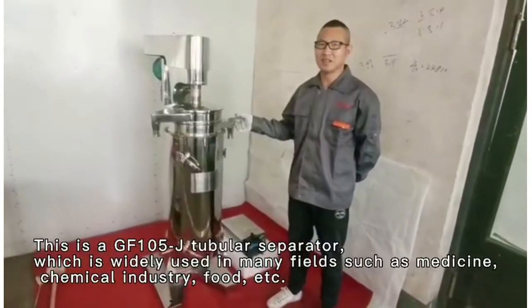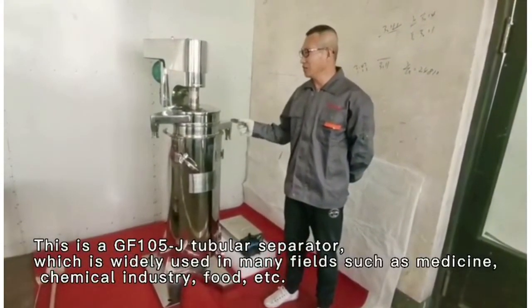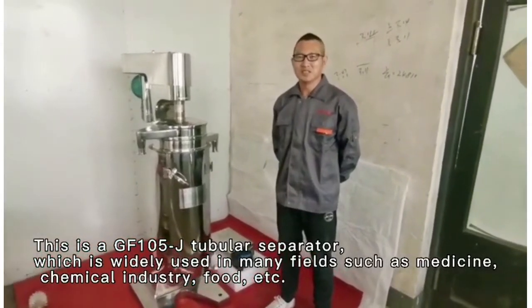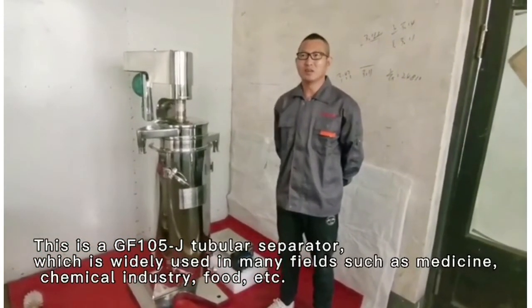This is a GF105-J tubular separator, which is widely used in many fields such as medicine, chemical industry, food, etc.